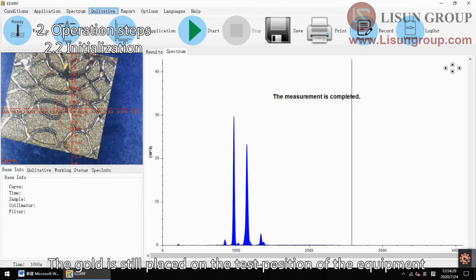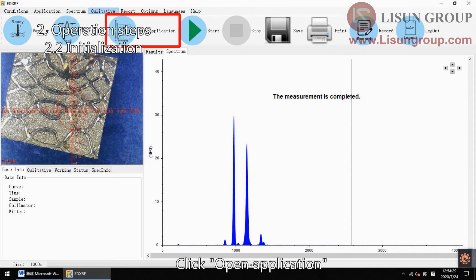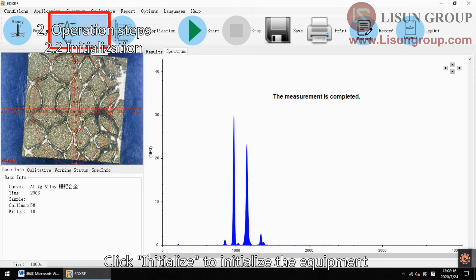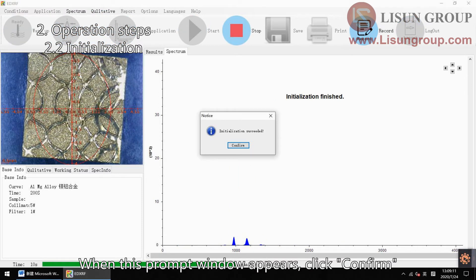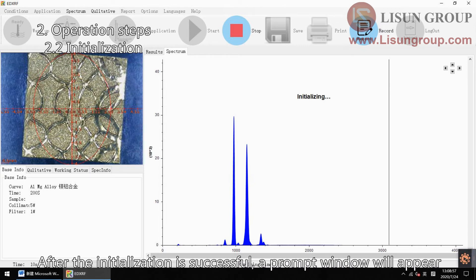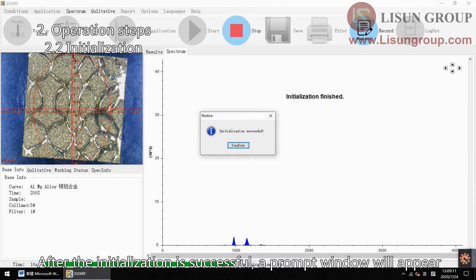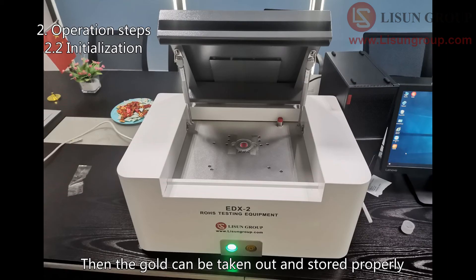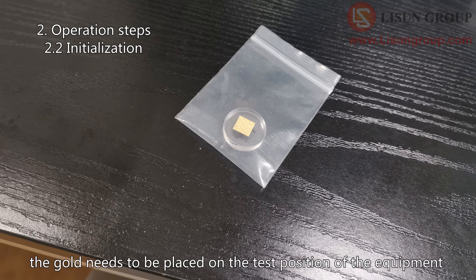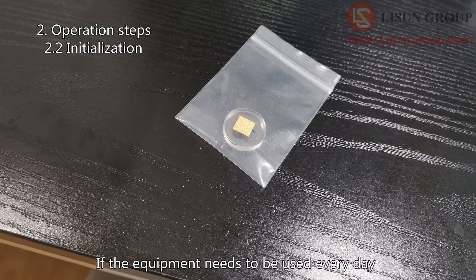The gold is still placed on the test position of the equipment. Click open application, choose any application and click open. Click initialize to initialize the equipment. When the prompt window appears, click confirm. The instrument is in the initialization process. After initialization is successful, a prompt window will appear — click confirm. Then the gold can be taken out and stored properly. Note that during warming up and initialization, the gold needs to be placed on the test position of the equipment. If the equipment needs to be used every day, it needs to be initialized once a day.